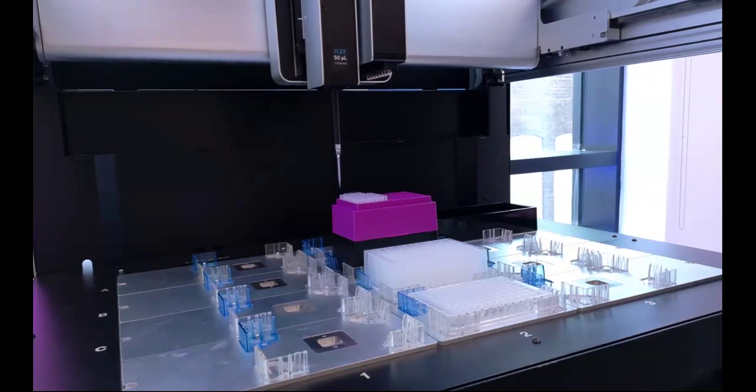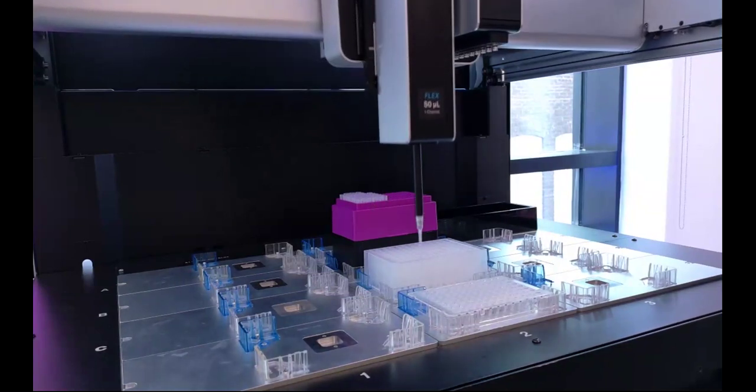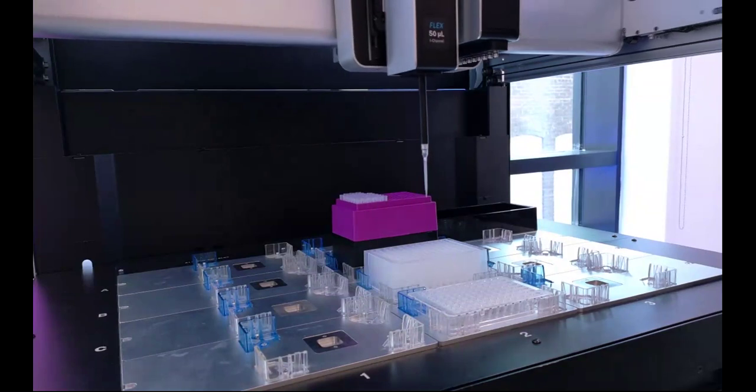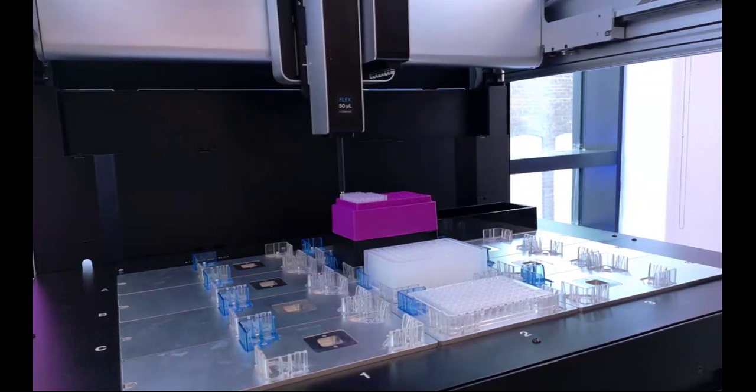And it will now pull from those disparate wells across the plate in more of a cherry picking fashion. As you can well imagine, if you had a 96 channel head, this is a fantastic way to plate stamp, especially moving from 96 to 384 well, really simply, instead of doing that by hand. So that functionality is entirely unlocked with this new feature.